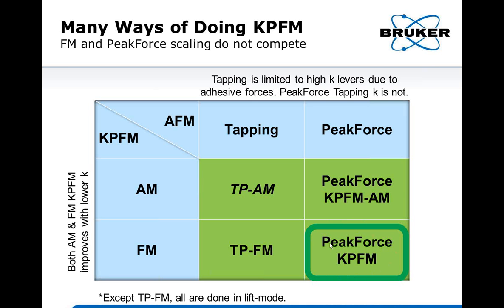So take notice. The PeakForce KPFM FM mode, I will just give a short name: we call it PeakForce KPFM. When I say that, that means PeakForce tapping mode combined with KPFM frequency modulation mode. That will be the focus. I will mention other modes just in case I want to compare the merits of each mode. In that case, I will make references to them.